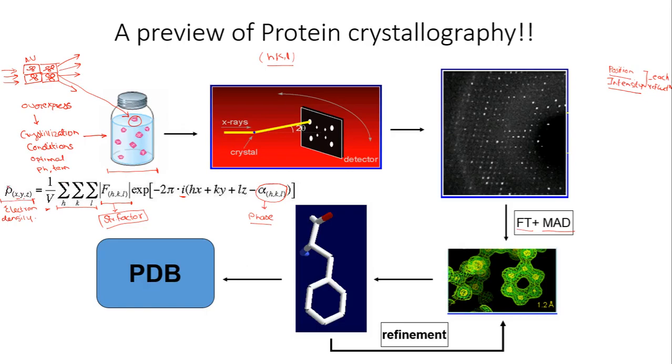So, long story short, the step needed after you obtain these spots, or the position of each and every spot from your X-ray crystallography experiment, is that the objective is to create electron densities, and that is usually done by implementing this Fourier transform. Now the next thing to be done is that this electron density map has got resolution.